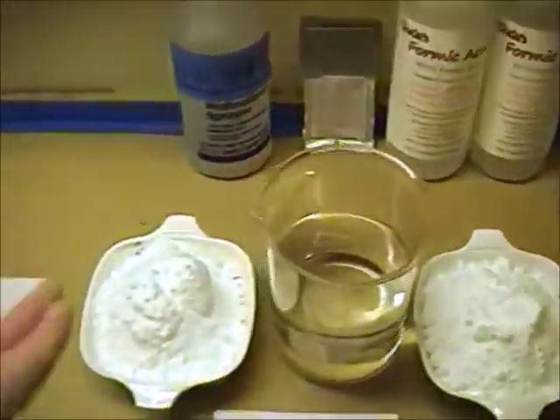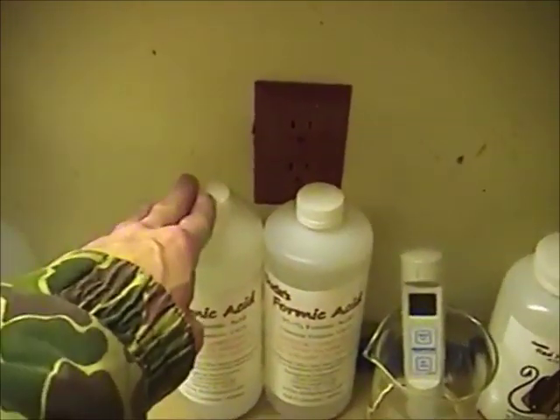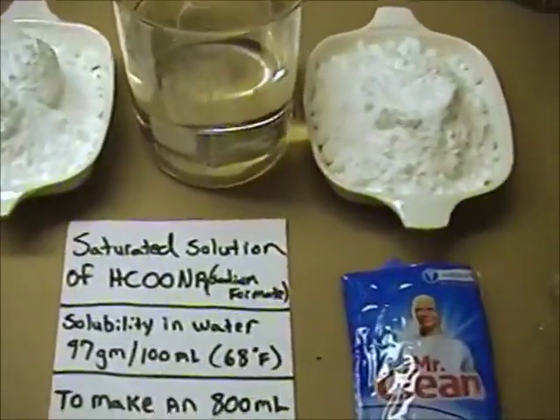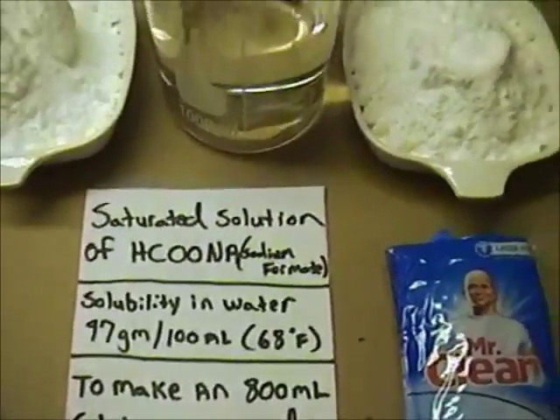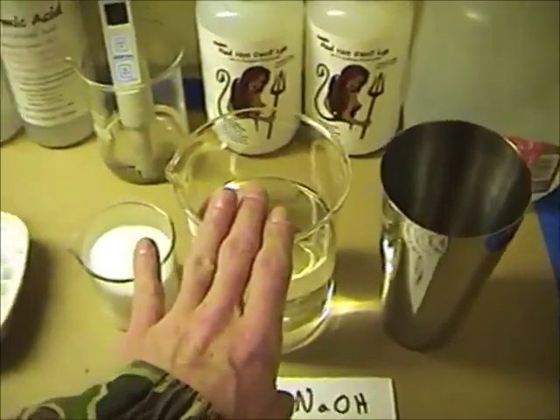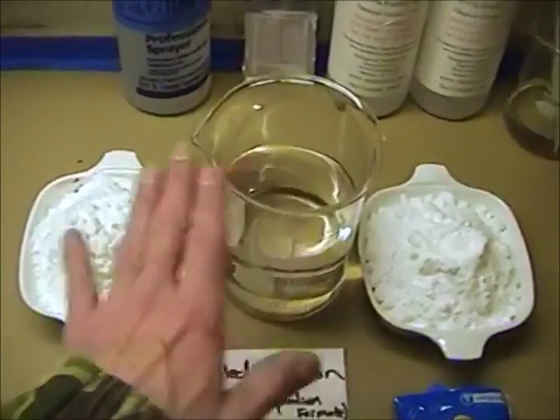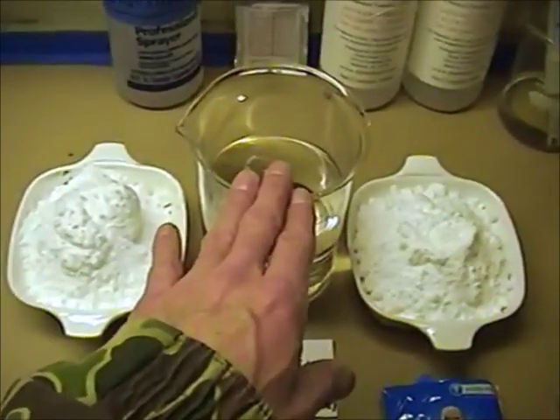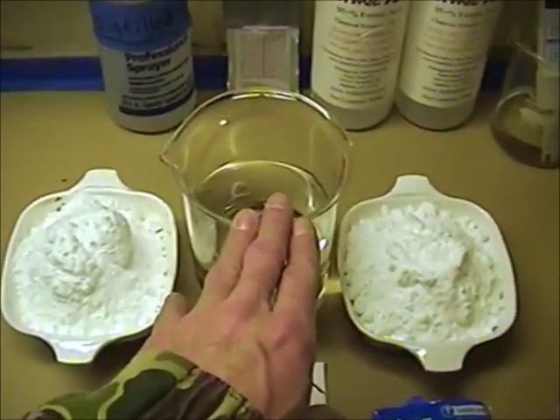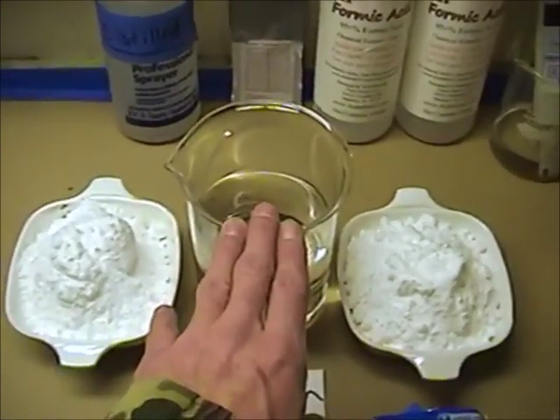Now this is the same thing as this, except it has sodium added in a chemical process, and you come up with sodium formate. So, we'll look down here. Now, remember, this is going to be at room temperature, and this is going to be at room temperature. So room temperature is going to dictate our solubility of our sodium formate in our solution. Now, I could force a whole lot more sodium formate into this volume of water, but upon cooling, the excess is going to precipitate out. It is just wasted product.